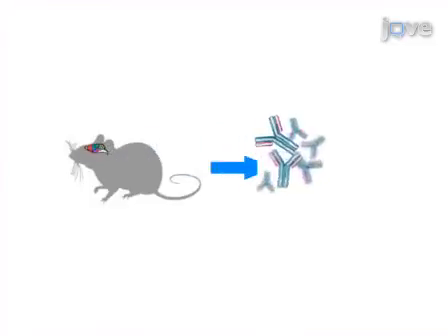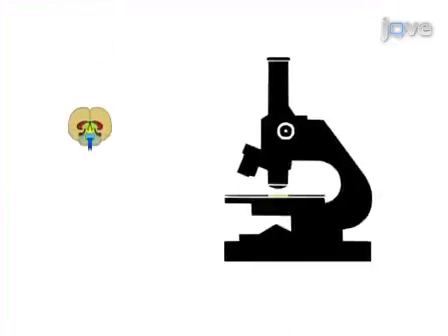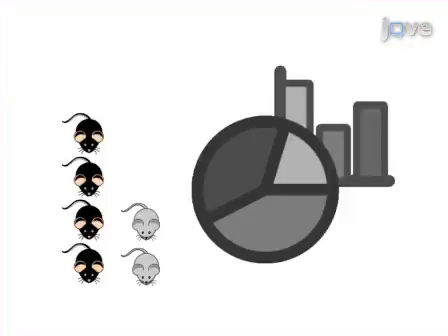The next step of the procedure is to collect brain samples and analyze them for the presence of vasopressin immunoreactive tissue in the target area. Neuroimaging software is then used to determine species-specific differences in targeted brain areas. Ultimately, results can be obtained that show species-related differences in paternal responses and vasopressin immunoreactivity in specific brain areas.